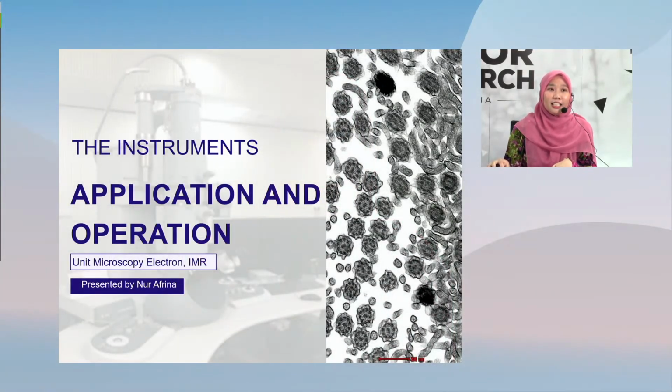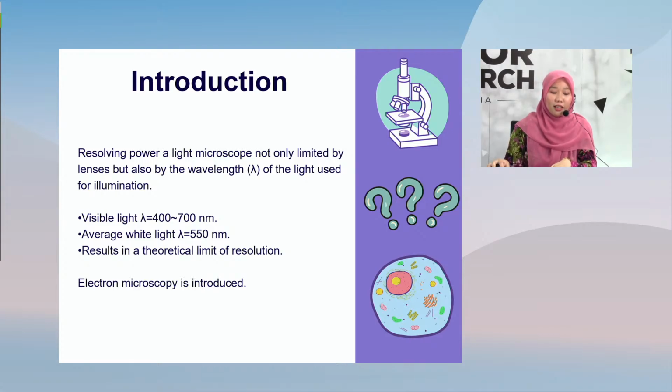As we all learned about light microscopy, which was the standard in the middle of the 20th century, it has remained tremendously useful until today.